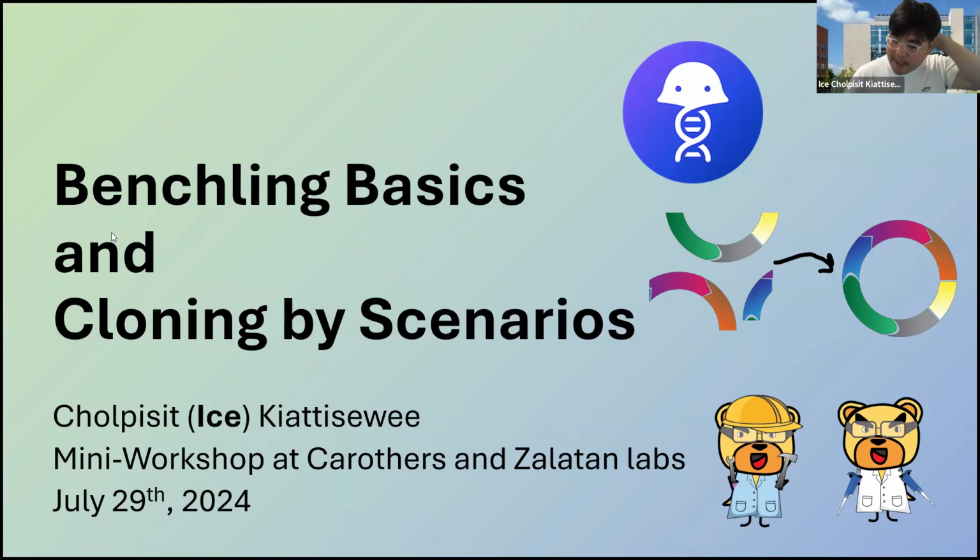But I want to call this not a lecture, but more like a workshop about how to use Benchling. I call it Benchling Basics, and also a little bit of cloning. I really want to use the phrase cloning by scenarios, because we can discuss what scenario you end up with when you're doing DNA cloning or something like that.